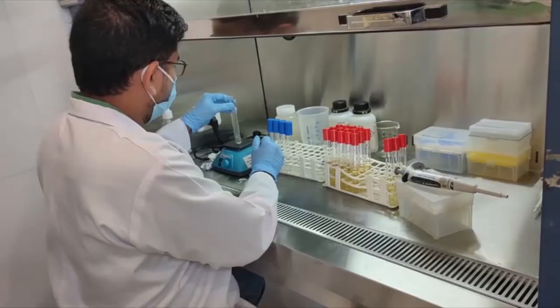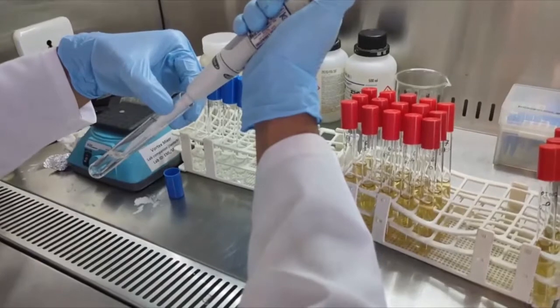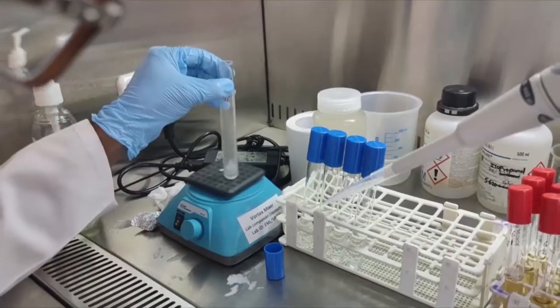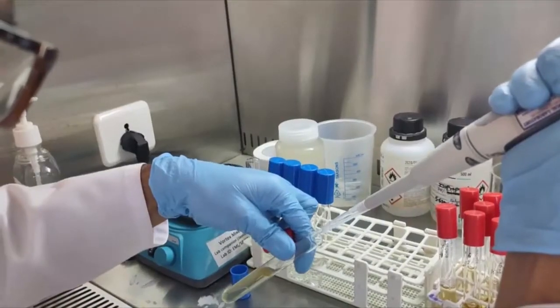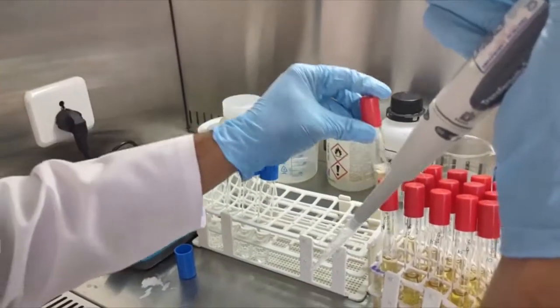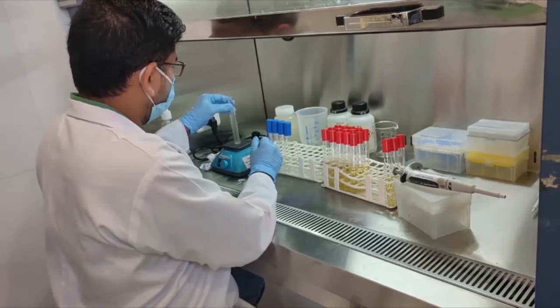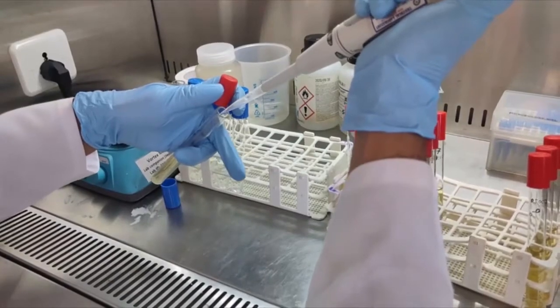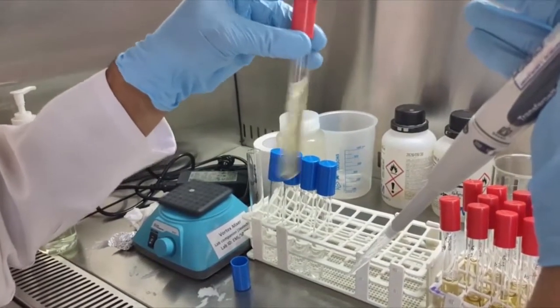Mix the sample by vortexing and add 1 ml into each of the 3 tubes in a row with sterile medium, then gently shake. Continue inoculation for the rest of the dilutions by adding properly mixed 1 ml of sample from each dilution into each of the 3 tubes in a row. Care should be taken that no air enters inside the Durham tube while shaking.